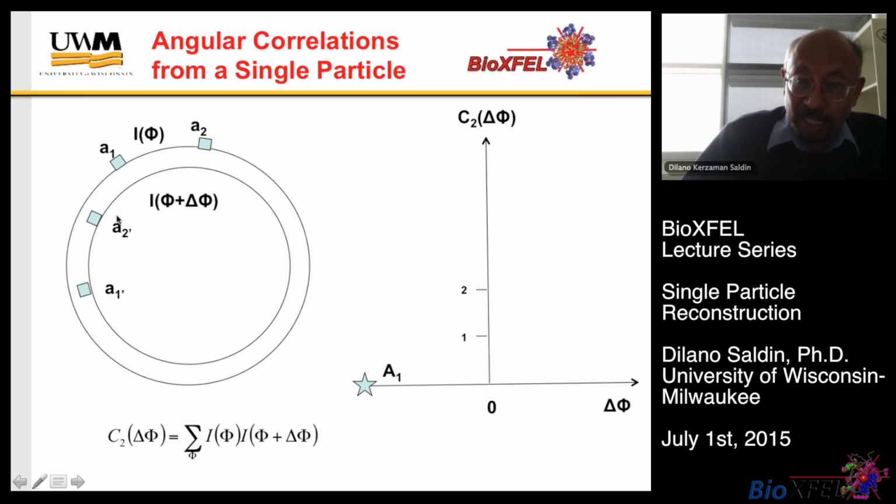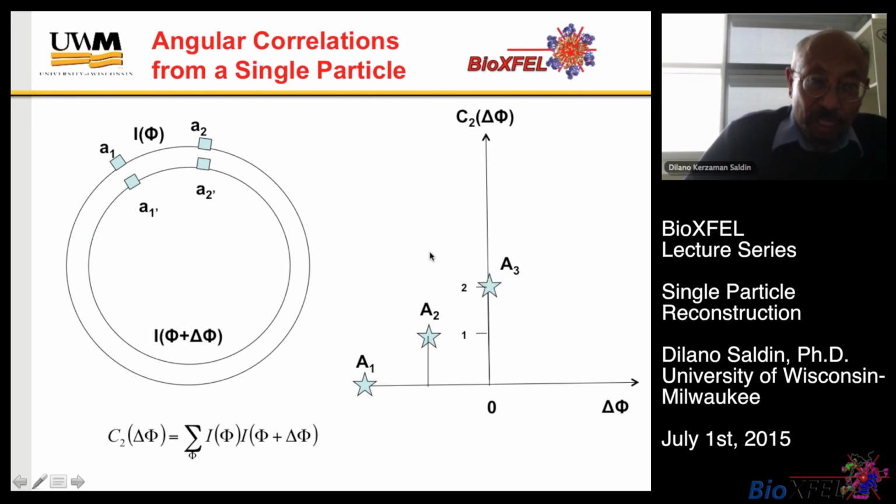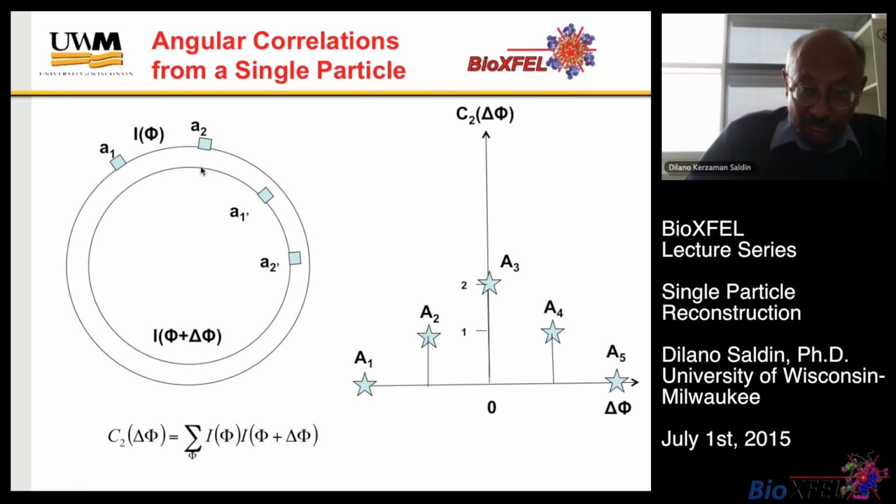That's what you see here. Now, as you move the relative positions of the peaks on one copy relative to the other, you might reach, say, this situation where the A1 is coincident with the A2 primed, and then you will get a noticeable intensity contribution to what I call the correlation function. As you keep moving it, the intensity will get higher when both the peaks overlap, and it'll get lower again, and finally go back to 0 when there is no overlap.